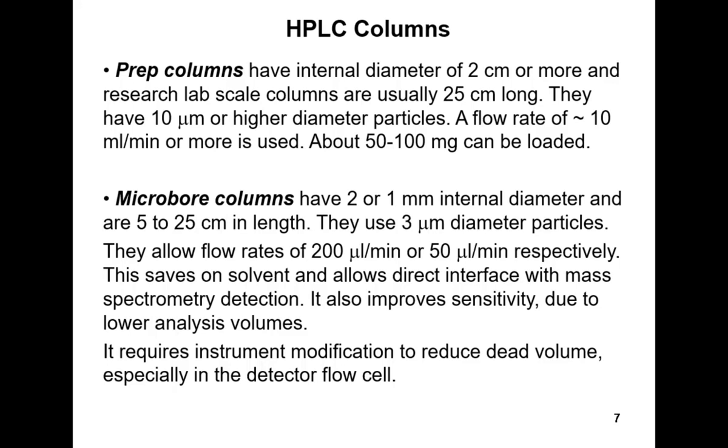That would usually be 10 micron diameter particles and a flow rate of about 10 milliliter per minute to give the optimum separation.